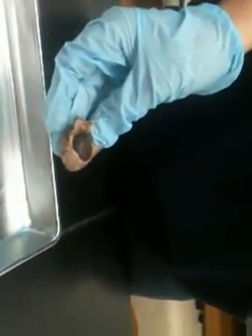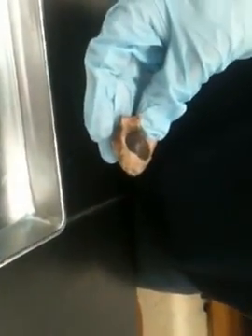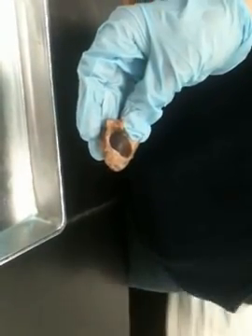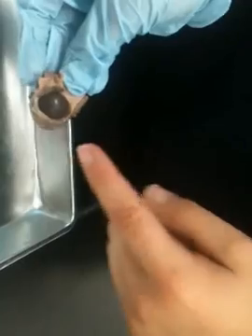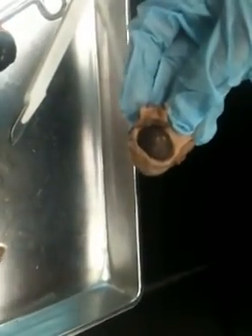The cornea is just modified sclera. So remember, the sclera is the white of the eye, and it covers the entire eye. But when it's on top of the iris and the pupil, it's modified to be clear. So we call it the cornea. Okay. So that light can actually enter. And so underneath the cornea, you can see the iris. But when they're in the chemicals, it kind of gets cloudy, so you can't see it as clearly. Did you say it was modified sclera? The cornea is modified sclera, right, to be clear. Okay? I think that's most of it.